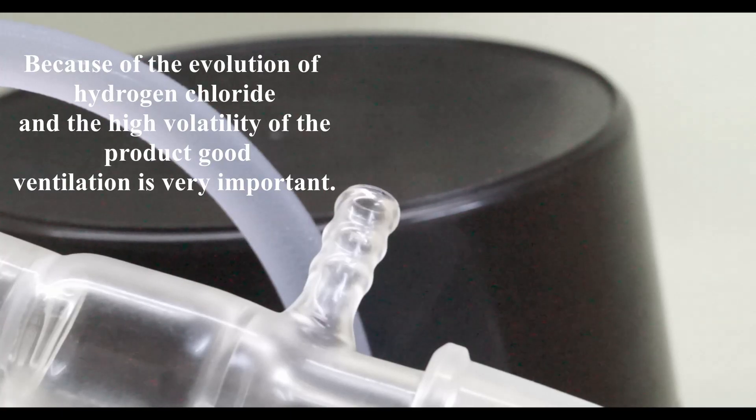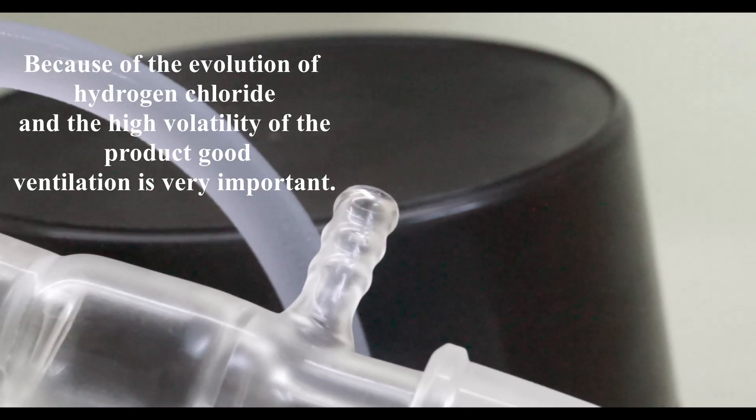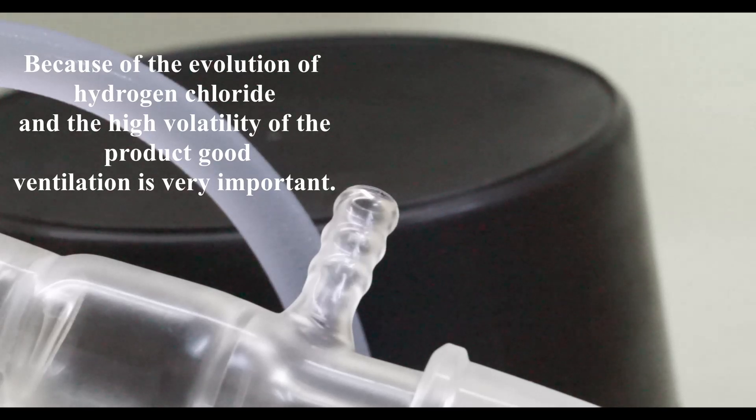As the reaction mixture heats up we see evidence of hydrogen chloride gas coming out of the apparatus. It is very important to heat slowly at the beginning so that we do not overheat the reaction mixture because this would lead to an even more vigorous evolution of hydrogen chloride gas and it could carry away a lot of our low boiling product.